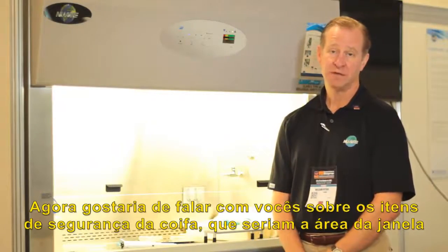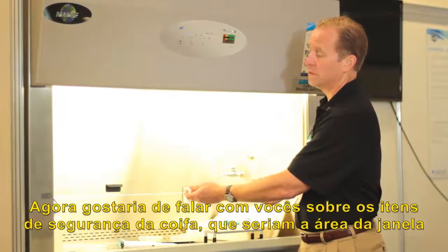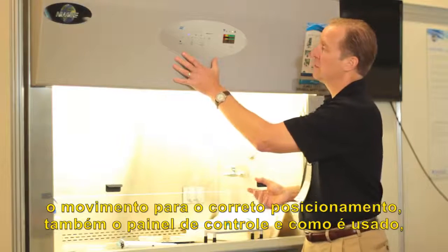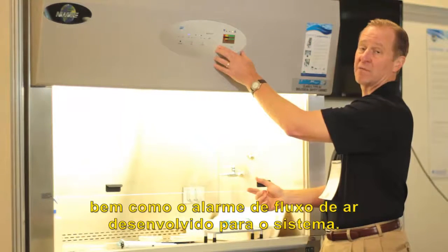I'd like to talk to you about safety features of the hood. This would be the window area of the hood, window movement and window positioning, also the control panel and how it's used, as well as the airflow alarm designed for the system.